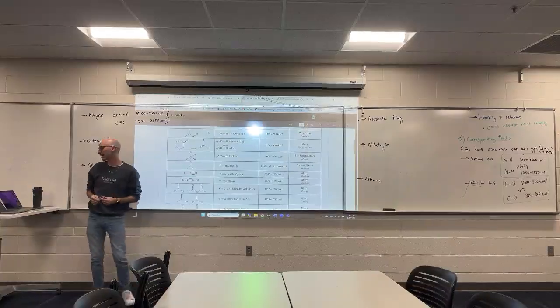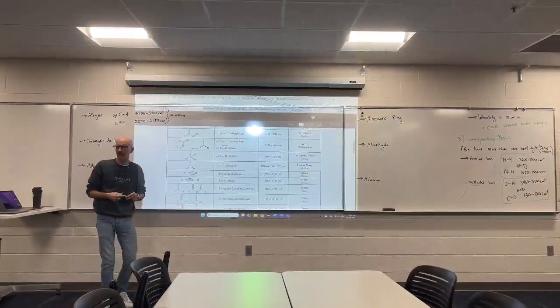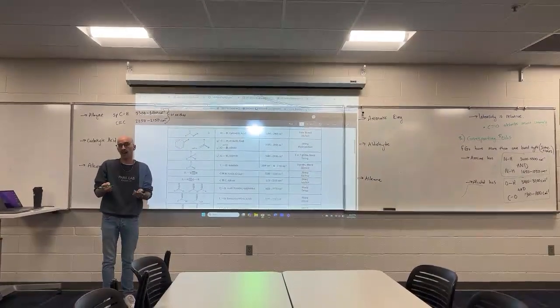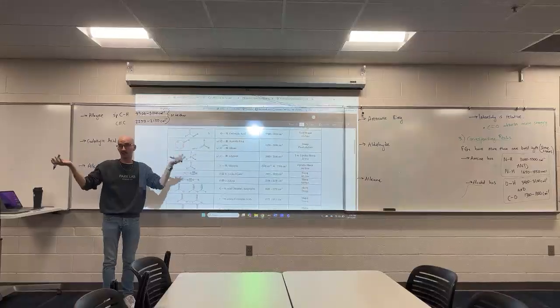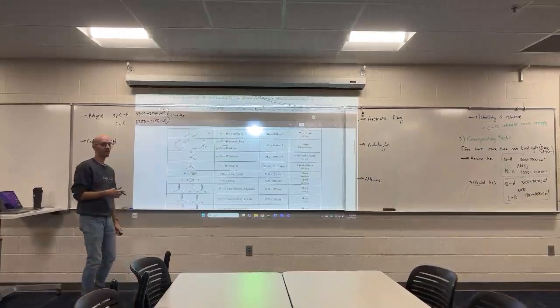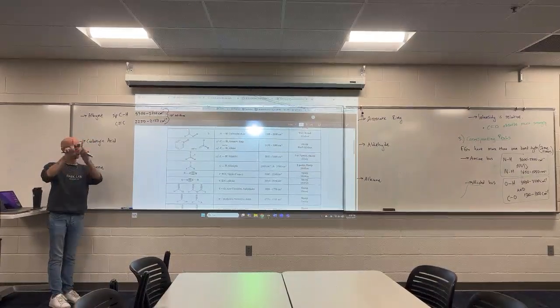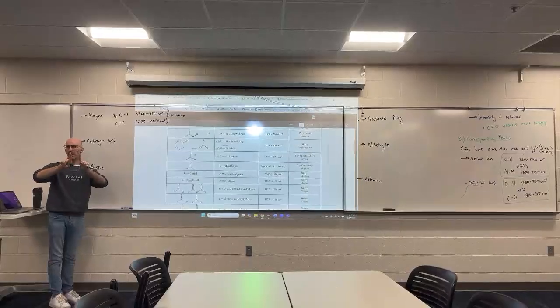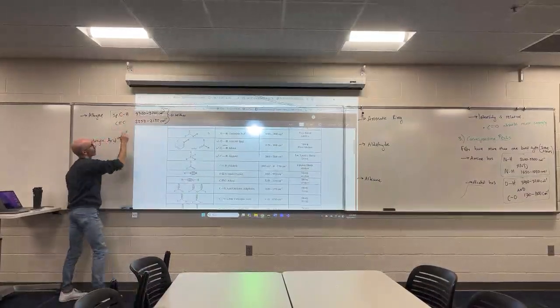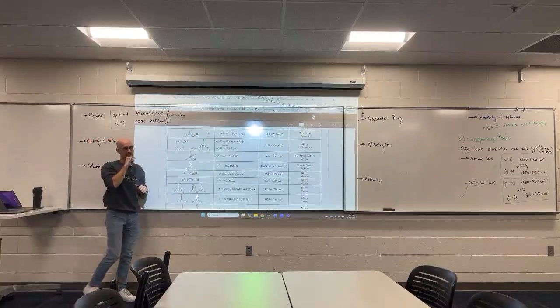Now, to be fair, is neither evidence of an alkyne? No, the absence of the signal doesn't indicate an alkyne. It's invisible to the IR. The IR won't tell you that it's present. What could help you? Carbon NMR. Carbon NMR would give you two signals in the triple bond region to help you distinguish that you do have an alkyne, excuse me.